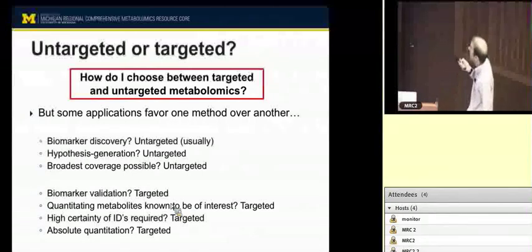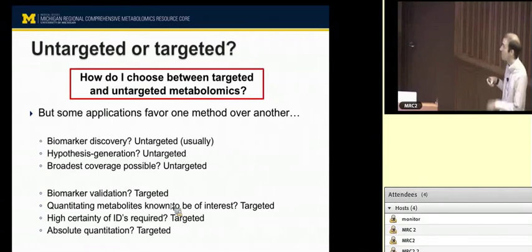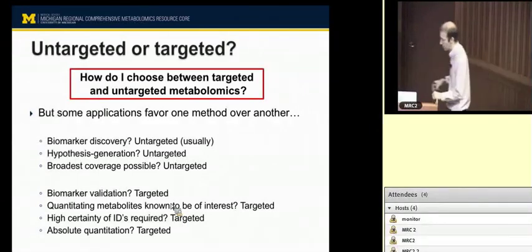And then the final step is to interpret the data. And this is true in untargeted metabolomics as well as targeted. You may go and visualize the data as a network, as a heat map to look at connections, correlations between metabolites, or you may use other tools to help you extract biological meaning.